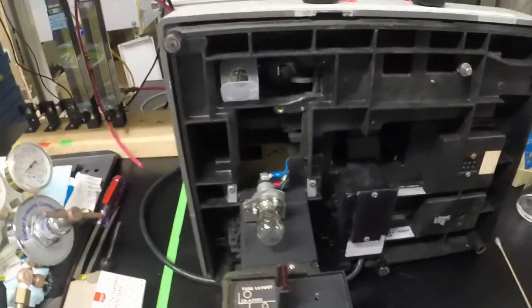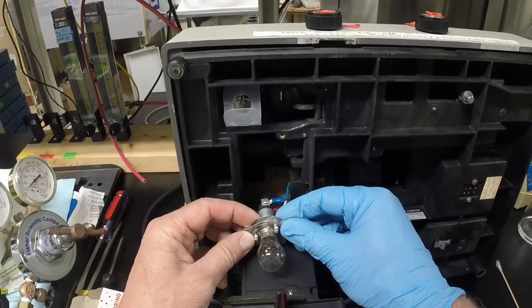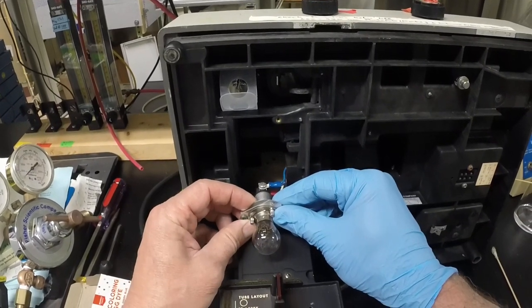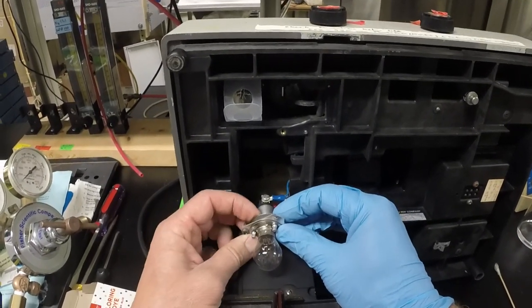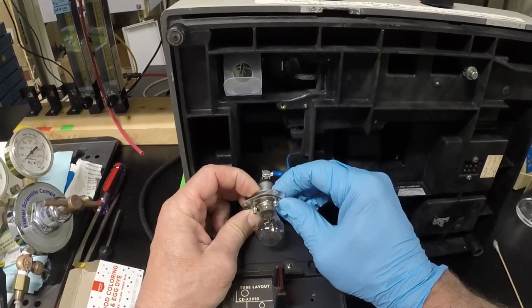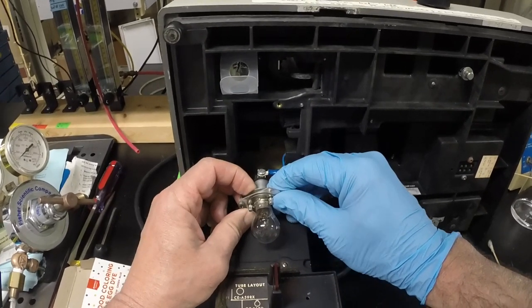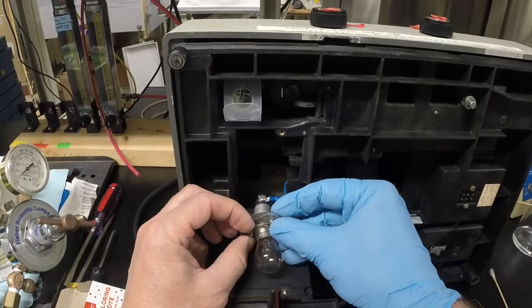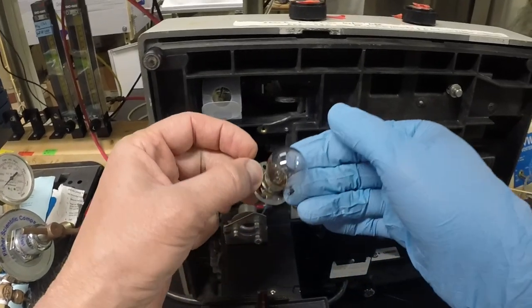To actually take the bulb out, it's going to be warm, but the reality is you don't even have to touch it. It's spring-loaded. So you push on that spring-load and rotate it, and the bulb will come out. Just like that.